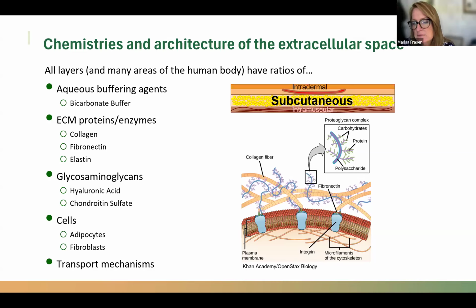Thank you. Another question is, esterase is a group of enzymes, probably with different selectivities. Can your assay be used on other ester prodrugs? Yes, we can integrate specific esters into these artificial ECMs. The esterase you see here is a general esterase purified from bovine liver.